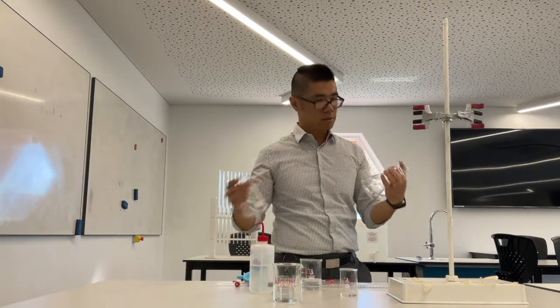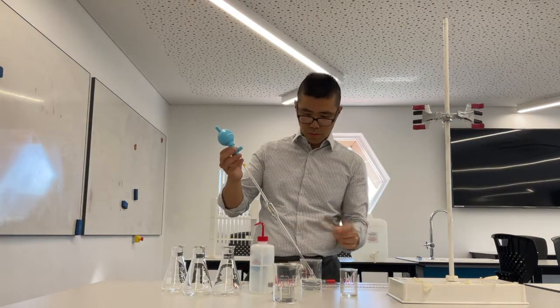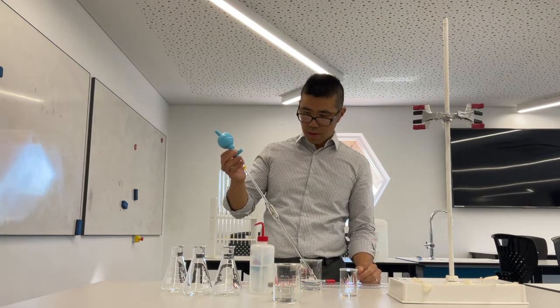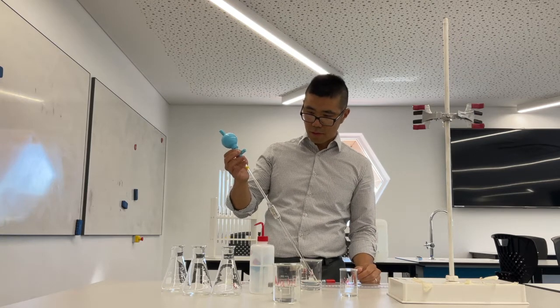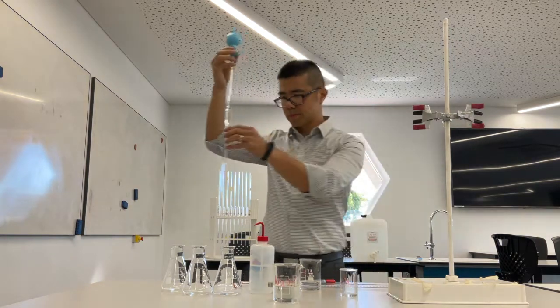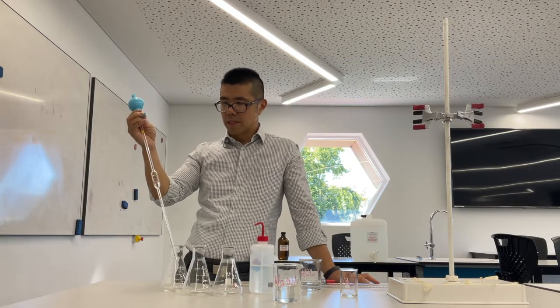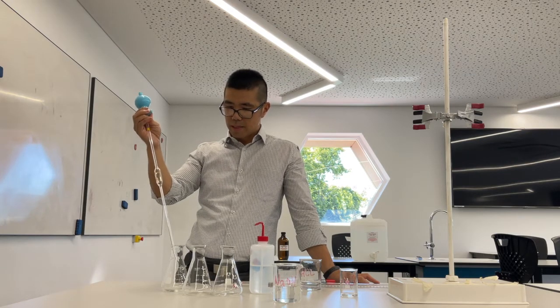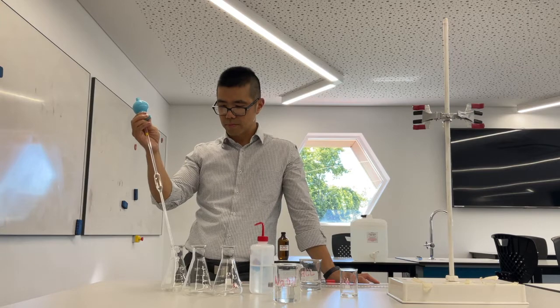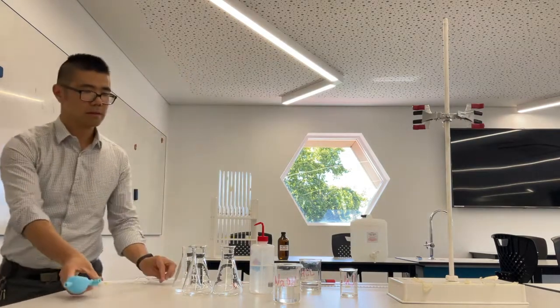I realized I need conical flasks, so I got some. Now I'm going to fill up the pipette with the solution. What you should do is fill it up past the line, then empty it down to the line. I press and hold the E button and leave the tip of the pipette against the glassware until it drains all the way through. Remember to hold the glassware against the other glassware to make sure you get all of the solution out. And then that's that.